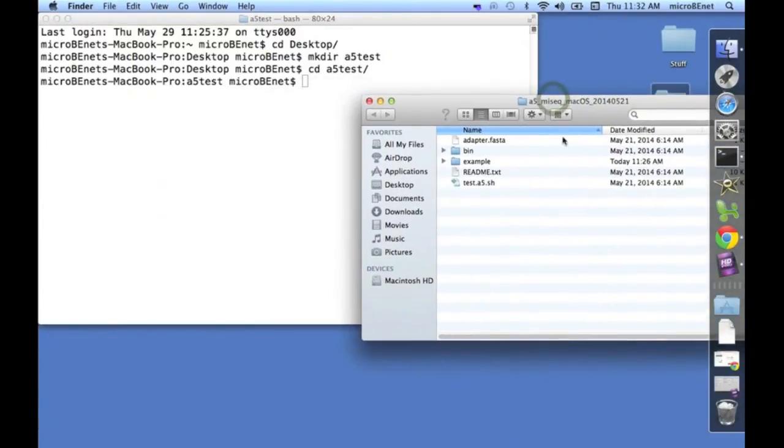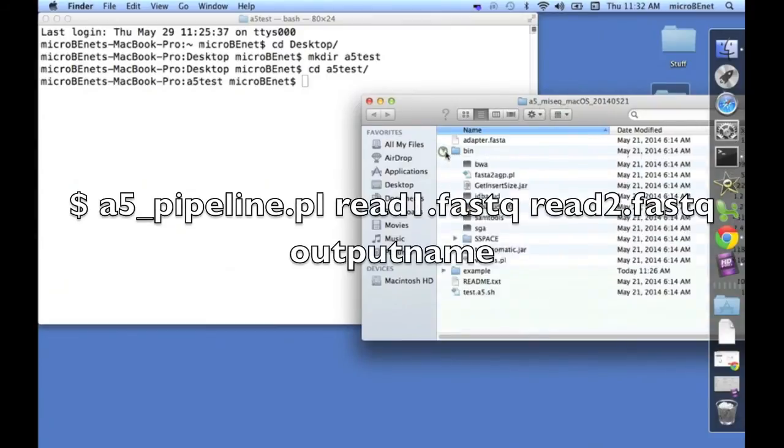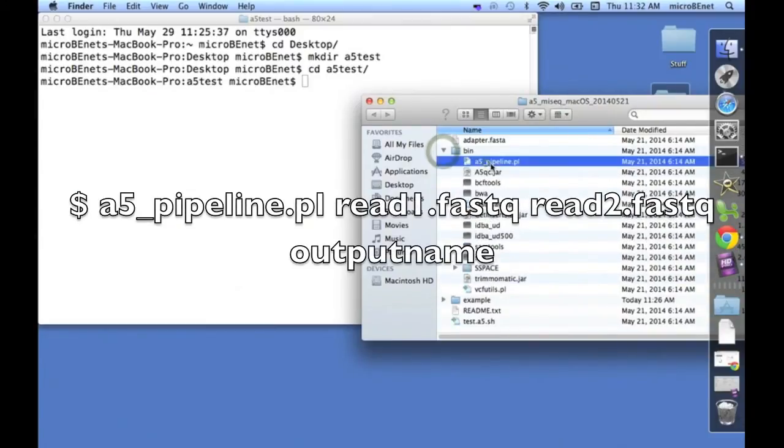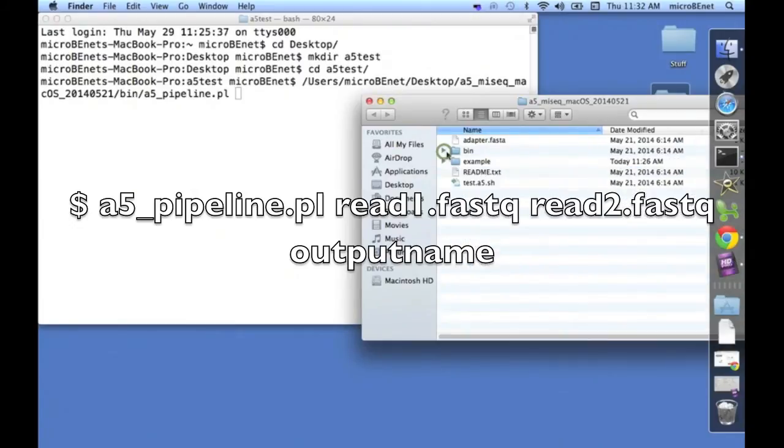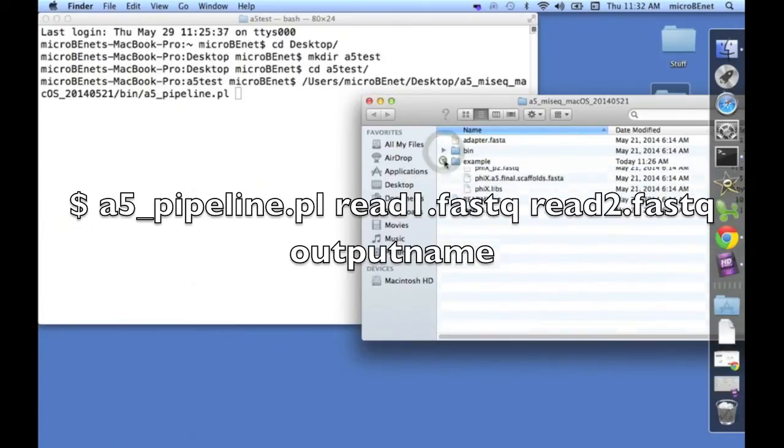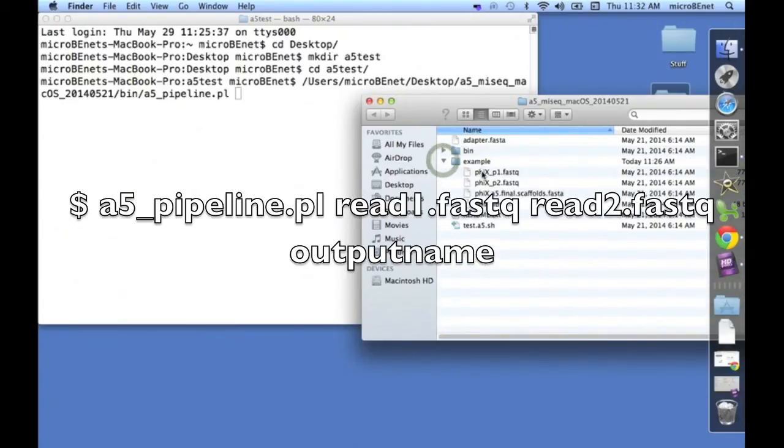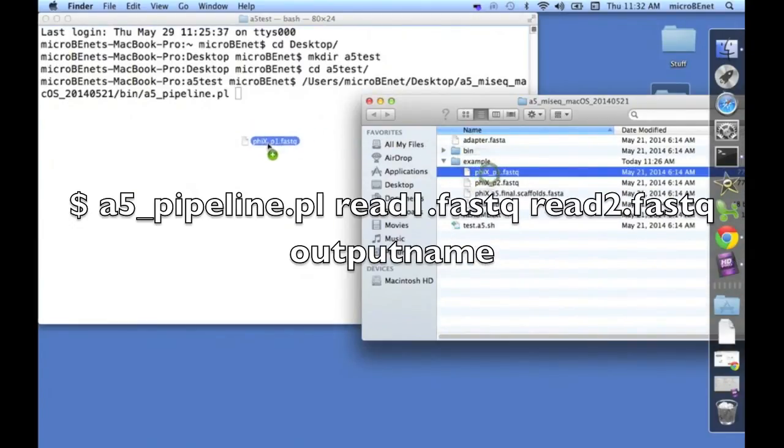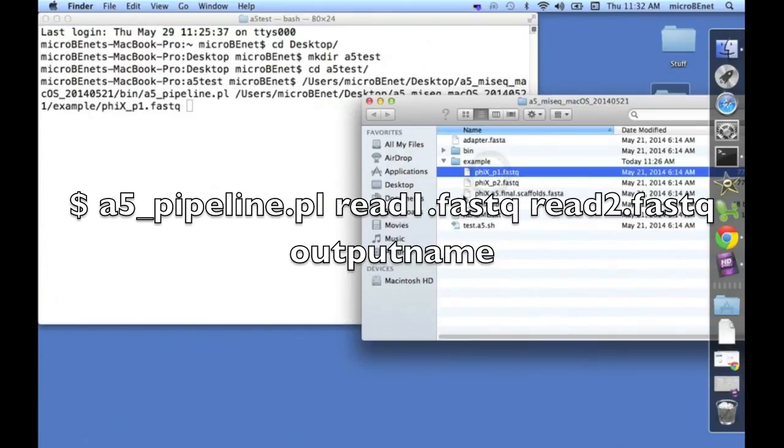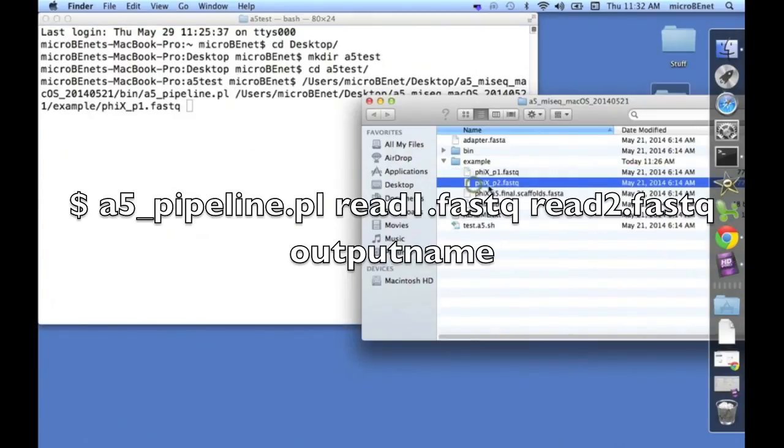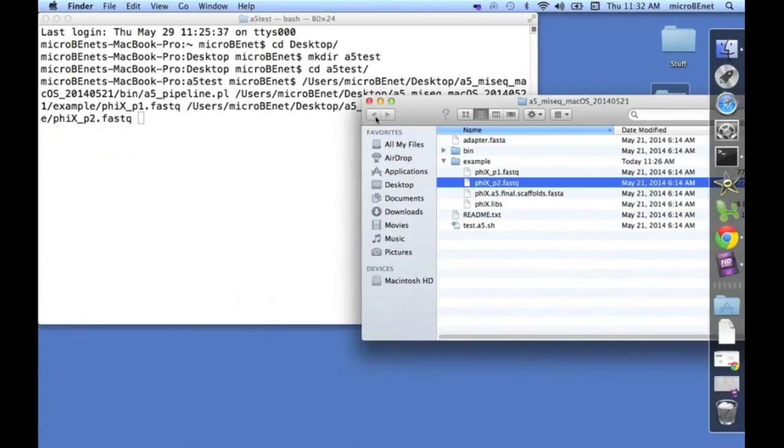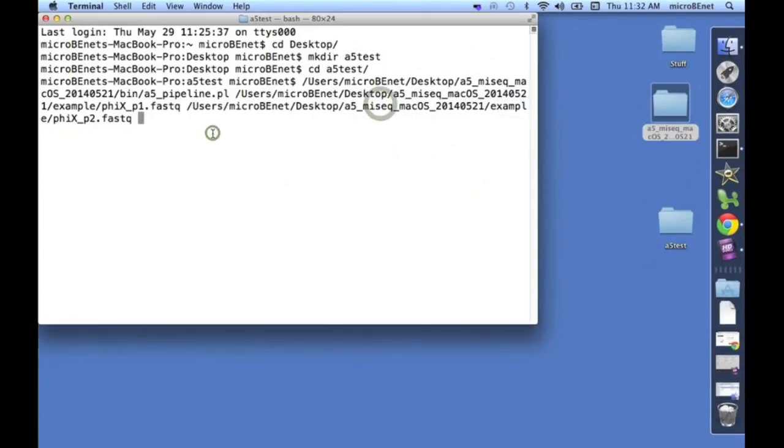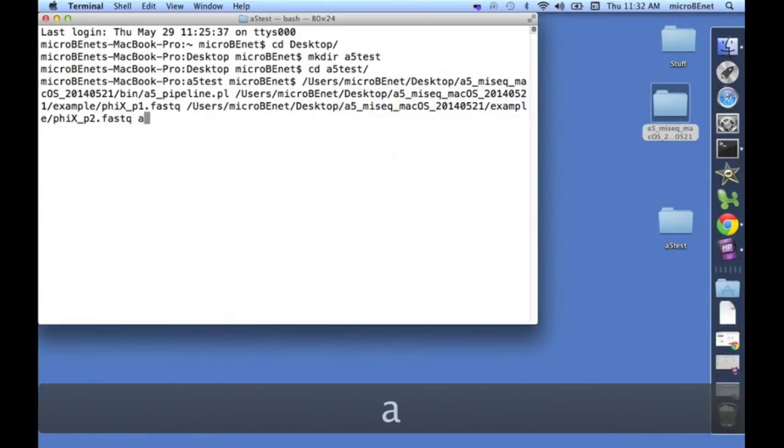And here's where we're going to run the assembly. So to run the assembly, you simply need the name of the pipeline, and then you need the reads. Here's read 1 and read 2. Note that A5 will also accept interleaved reads, where you only have one file for all your paired-end reads. And then you also need to give it a name. So let's just call it A5-Test.